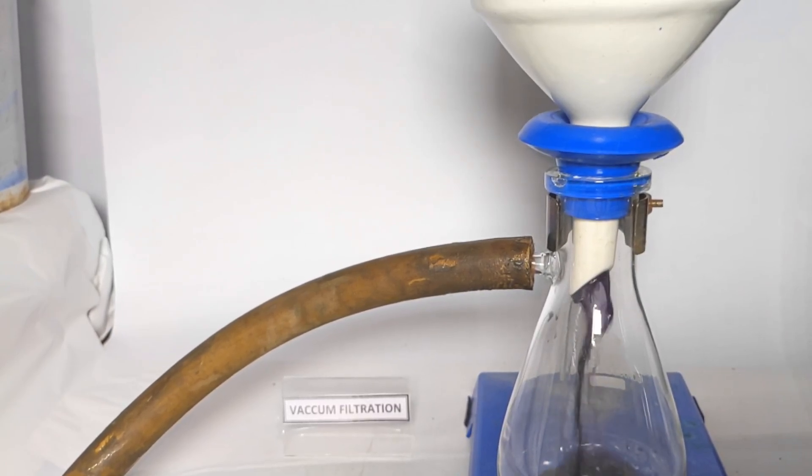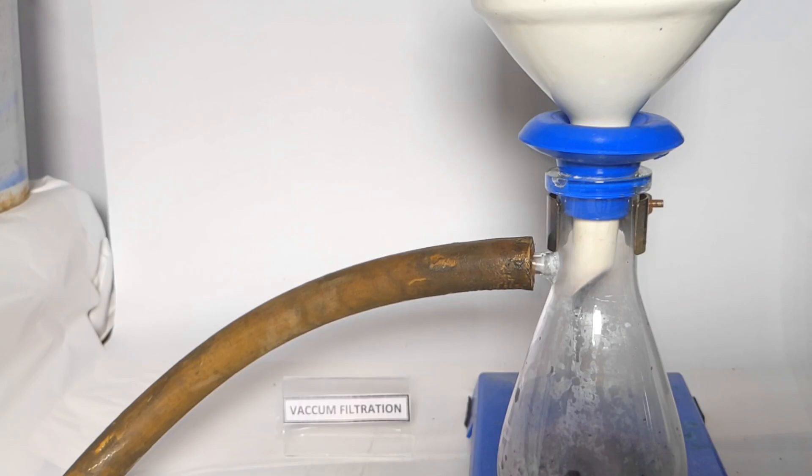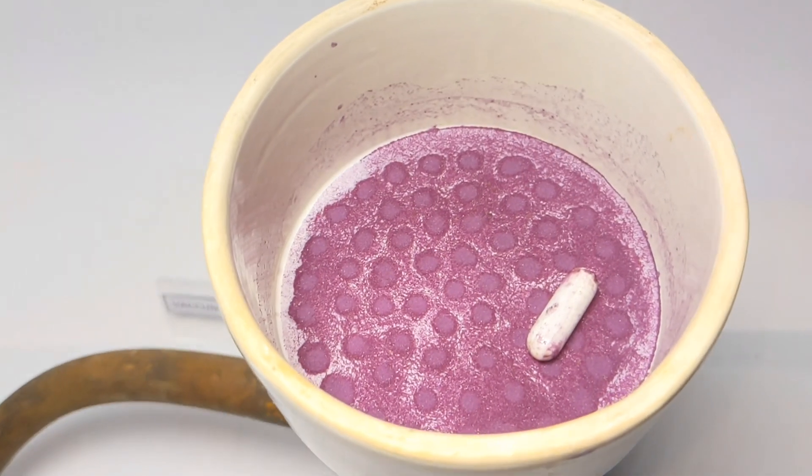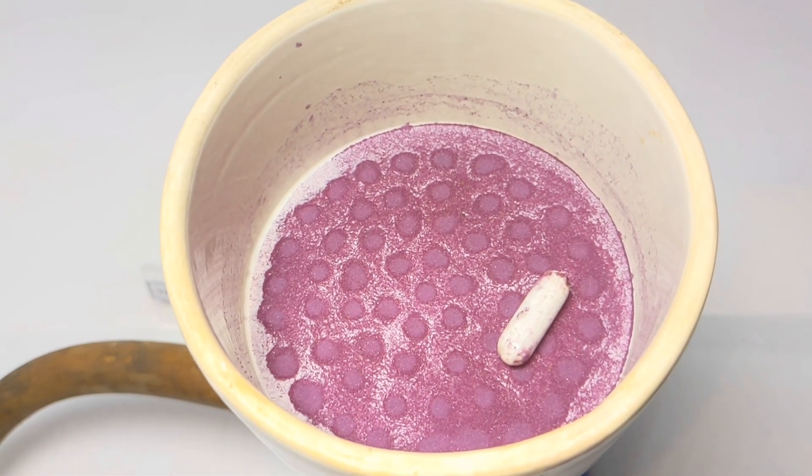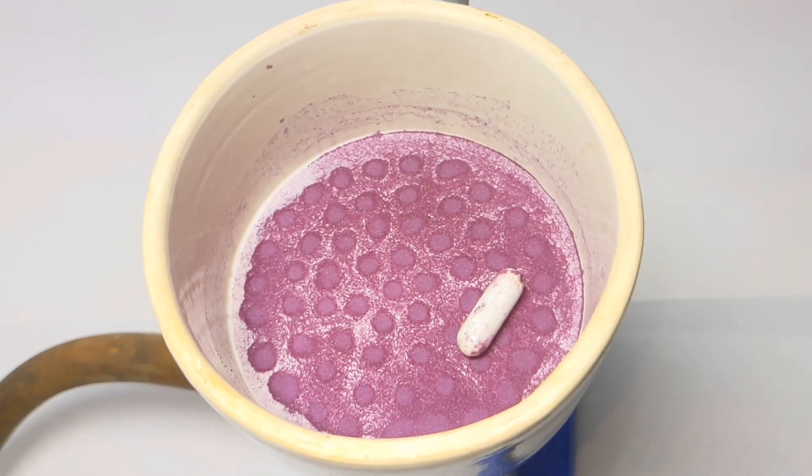The contents were then vacuum filtered and the product was collected in the Buchner funnel. The product has a nice purple color. This is the final product.